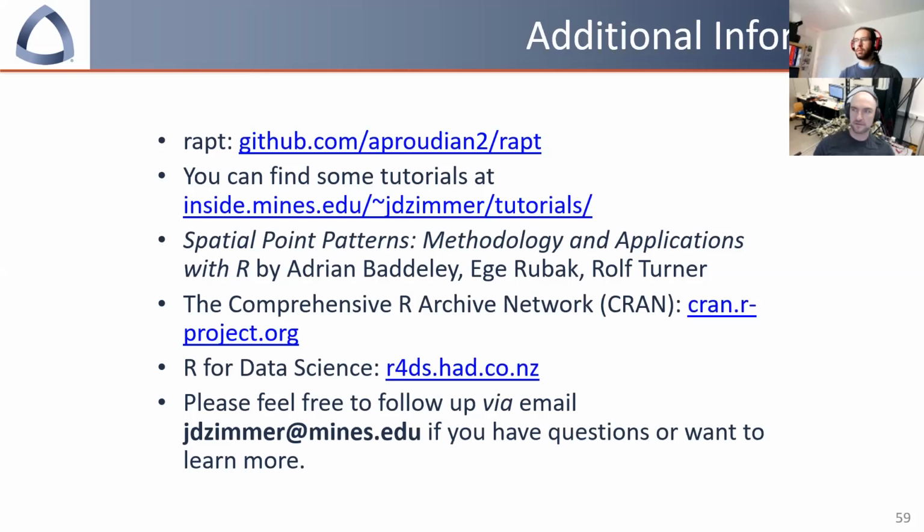And really, one of our long-term goals is being able to not only look for clusters, but identify and have a classifier of morphology in these systems, where we can take a data set and say, are we actually getting precipitate-type information, or do we have something more like a bicontinuous network? Our group really focuses on small molecule organic systems, which have pretty different characteristics and features of interest compared to a lot of the atom probe community. And so I'm really keen on getting feedback from this group, and more broadly from the community, about what features are really valuable to extend these analyses in a way that is broadly applicable.